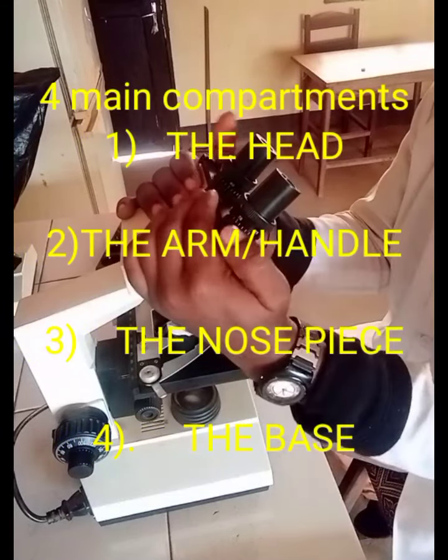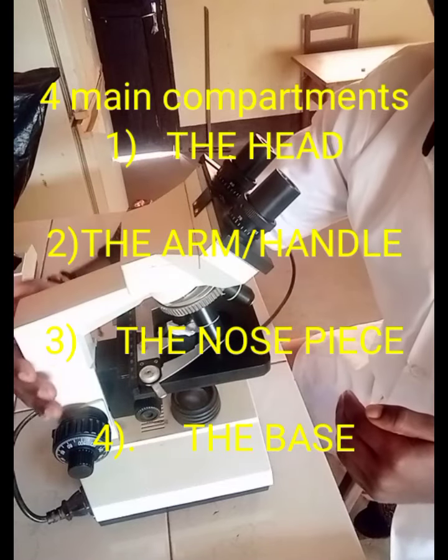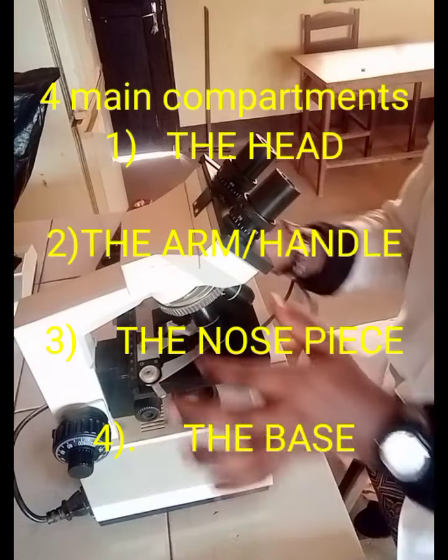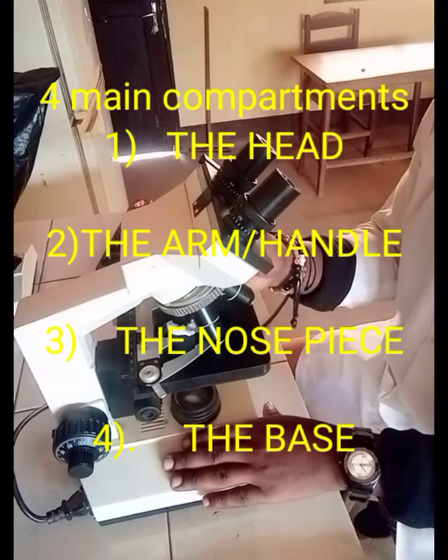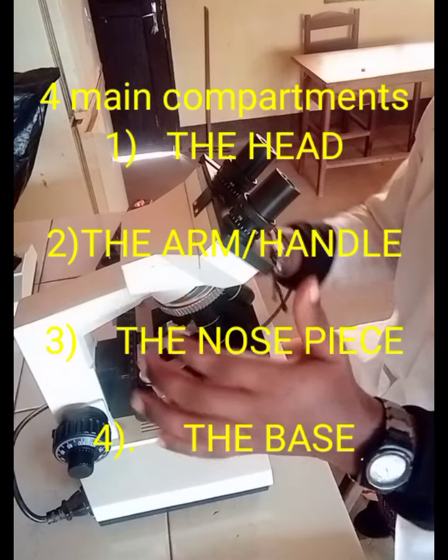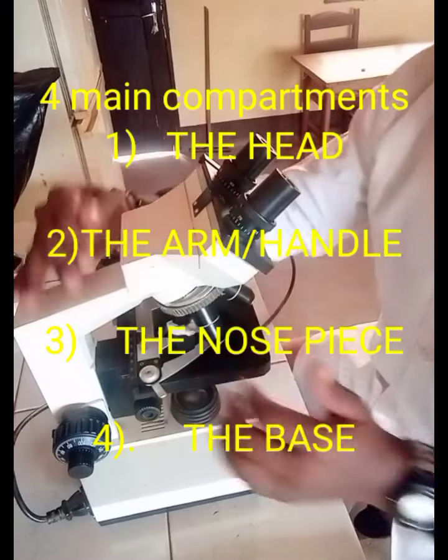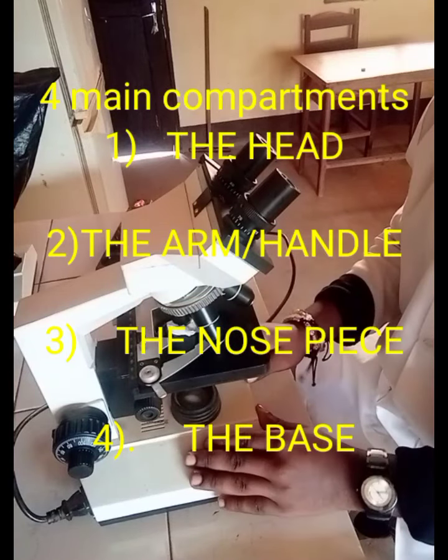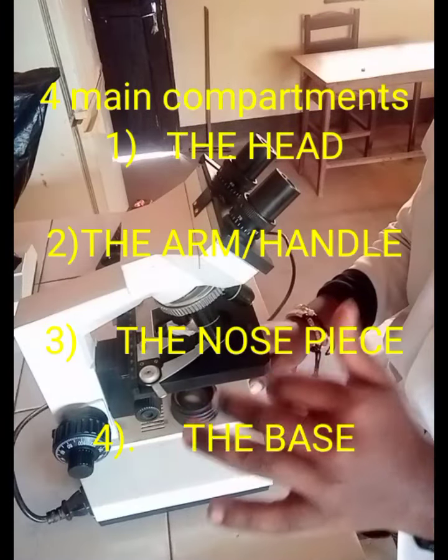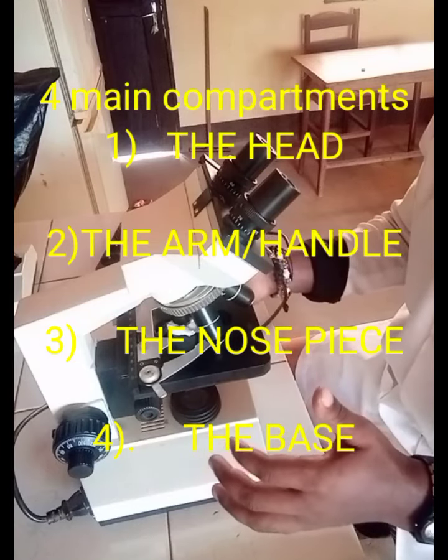We have the head of the microscope, the arm of the microscope, the nose piece of the microscope, and the base. I look at this microscope as a human, and so I begin with the head, the arm, the nose piece, and the base. Now, knowing those four parts, I can actually get to the other smaller parts.